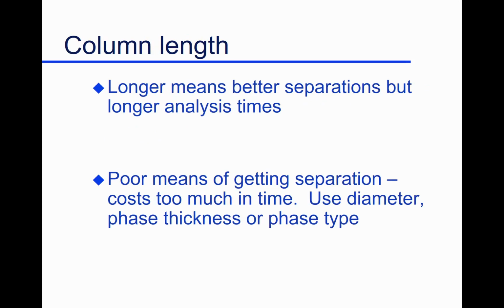Column length is another parameter. What do you do when you're not getting separation? Very commonly, you just get a longer column. You put a longer one, gives us more opportunity for interaction.